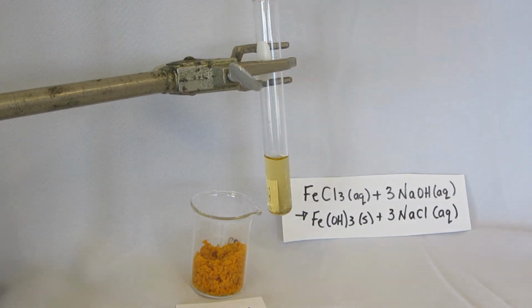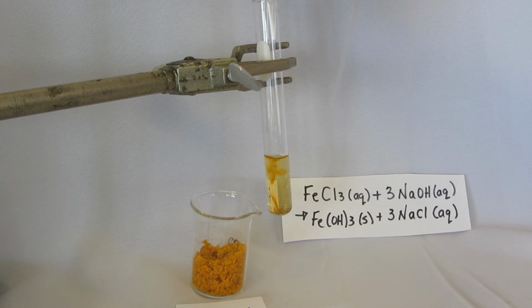In the test tube, I have a clear yellow solution of iron 3 chloride, and in the pipette I am adding clear sodium hydroxide solution, and when they meet, we see the formation of an orange-brown precipitate of iron 3 hydroxide, which in fact is an aqueous form of rust.